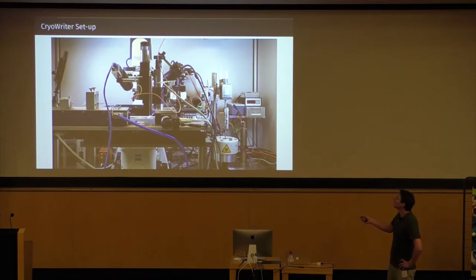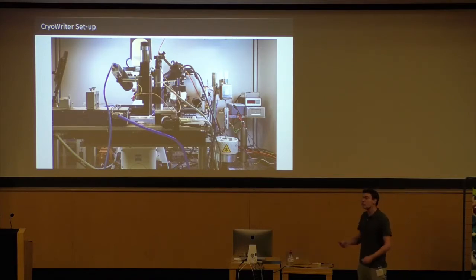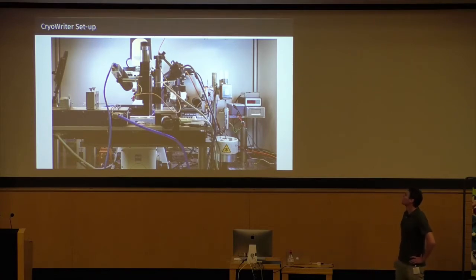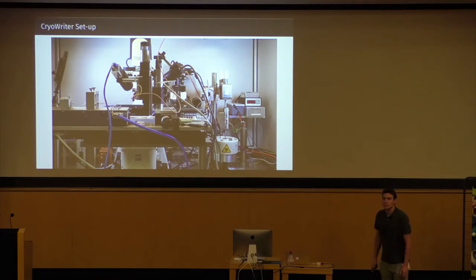On the right side we have a dew point stage, which allows us to control the temperature of the grid and produce a microenvironment around the grid, which is important during grid preparation. And here on the right hand you see the plunge freezing mechanism for sample vitrification.